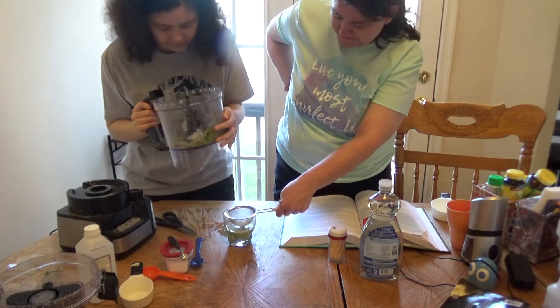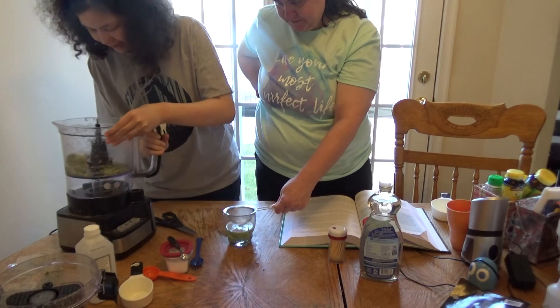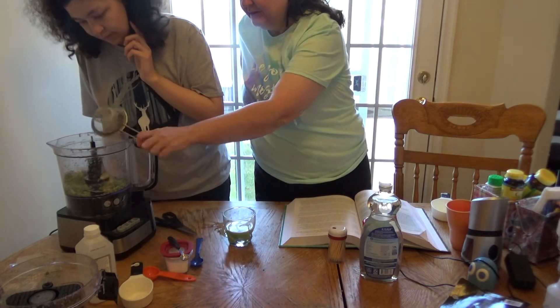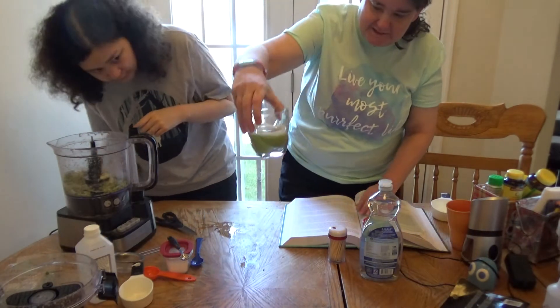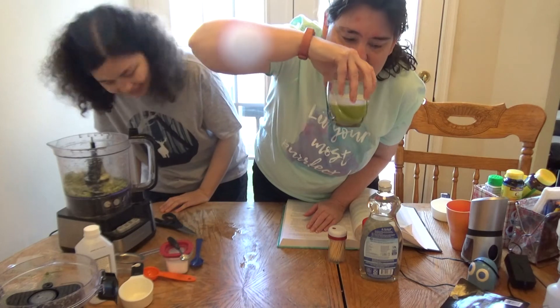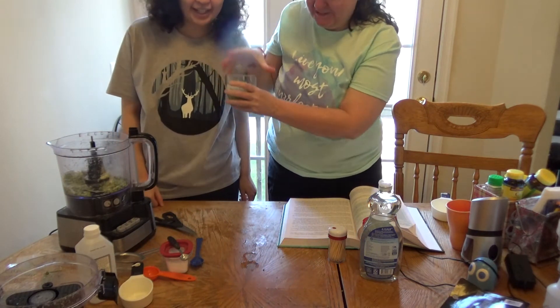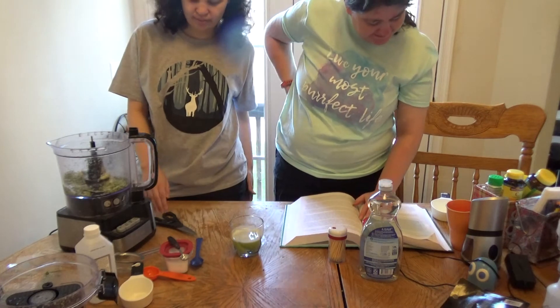Give peas a chance! Okay, let's make sure it all drains through. There's a whole bunch of peas in here. This is what we have right now. Oh, it smells like avocado — actually maybe not. It smells like fresh plants. It smells really good, actually. It smells like spring.